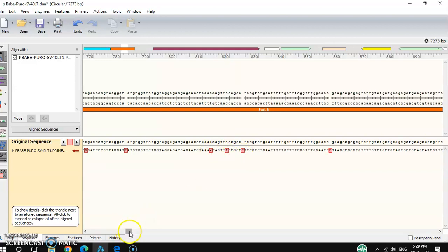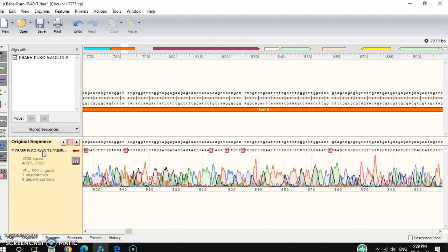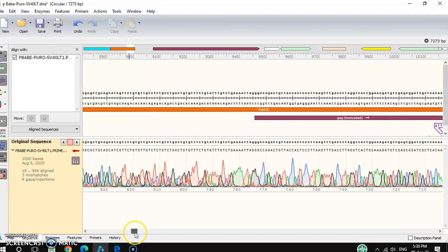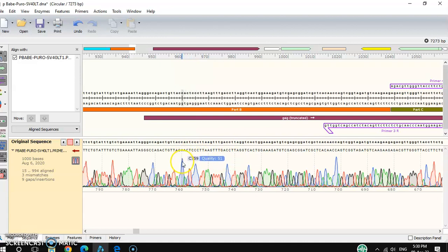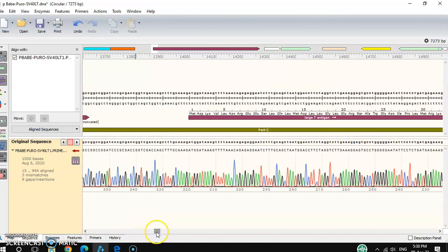This was just an example showing how you can check different kinds of mutations. If you would like to see the chromatogram data, click here. For each nucleotide base there is a respective peak — each peak represents one nucleotide base. If you take your cursor over a position, it shows the nucleotide base at that point. Where all the peaks are very sharp, each peak is dedicated to one nucleotide base, meaning good quality.